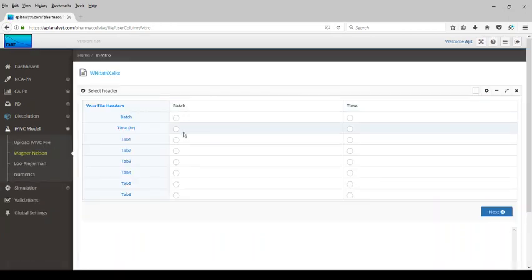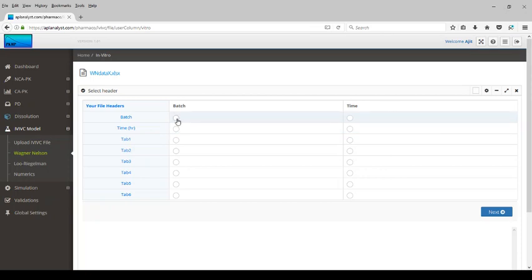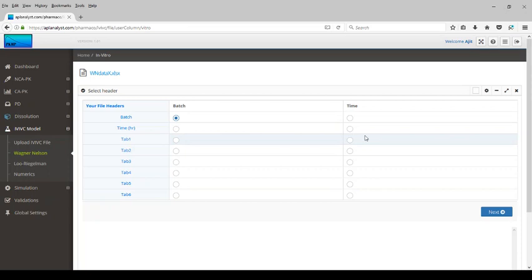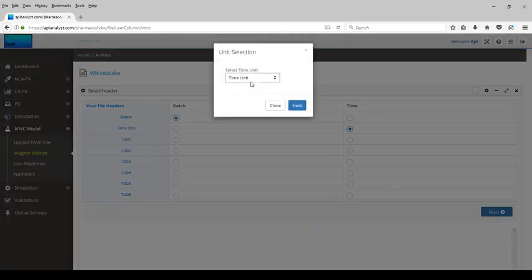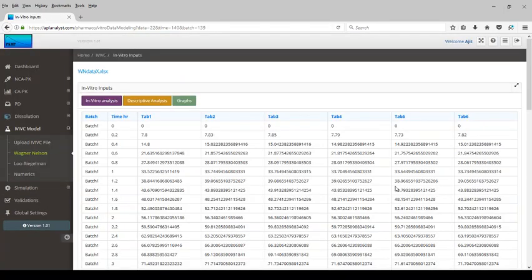Next, we perform the in vitro data analysis for the dissolution data. We select batch as the batch variable. These are the file headers mapped to the program-required variables. Click the next button and select the time unit — in this case, hours. The dissolution data is now displayed.